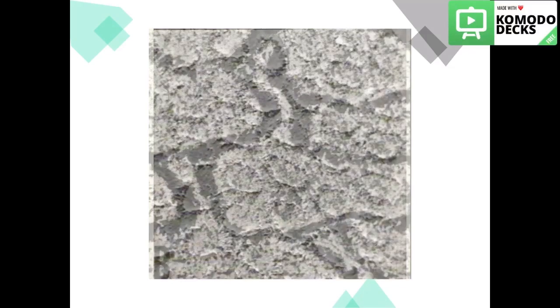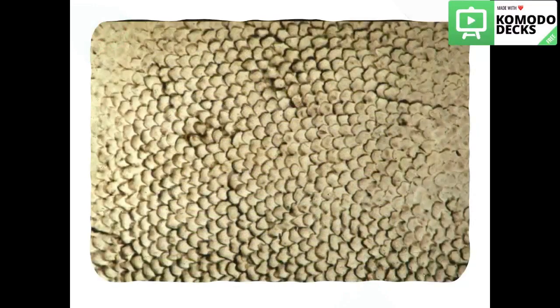The keyhole pattern, but this is not an optimal one, which means we are at a cutting angle between 45 and about 80 or 70. A circular pattern, but mostly what we can see here is the keyhole pattern.